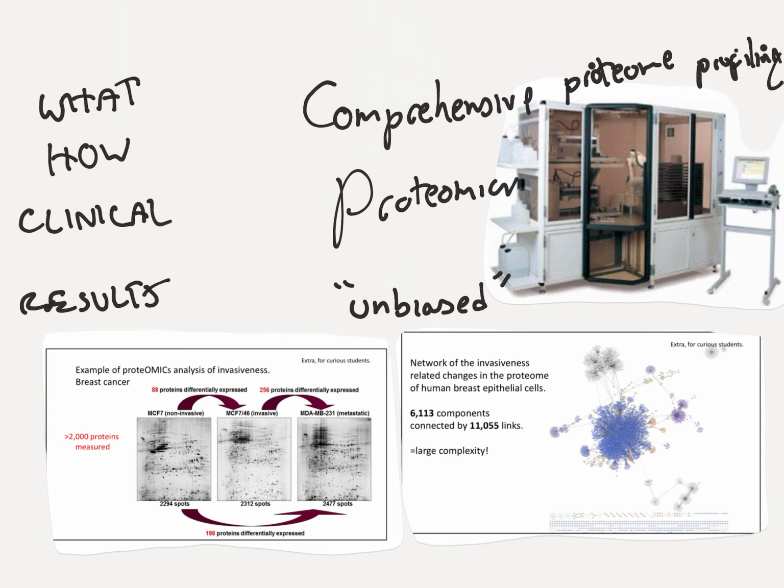We all know what peptides are. They're amino acid sequences. So it looks for a specific sequence, and if it finds a specific sequence in a protein, it calls it protein X or protein Y. Or it could just try to recognize the entire protein by looking at the full size thing instead. Okay, so now that that is out the way, I will consider the what part done.